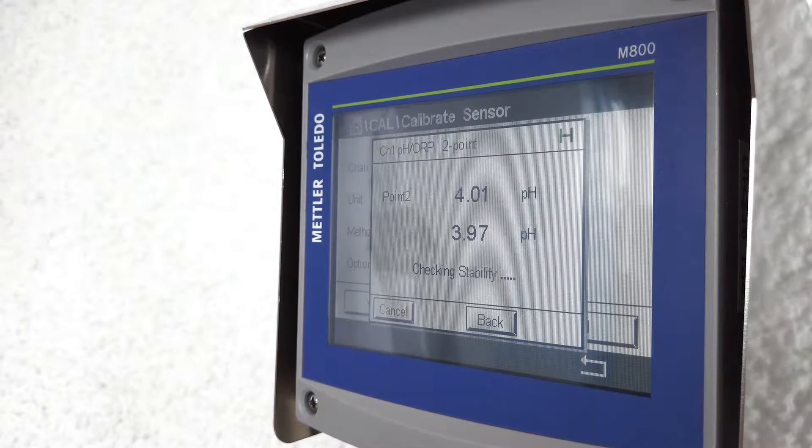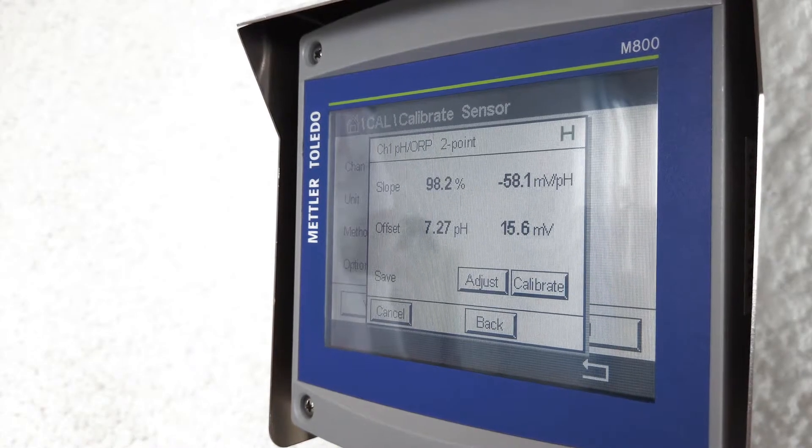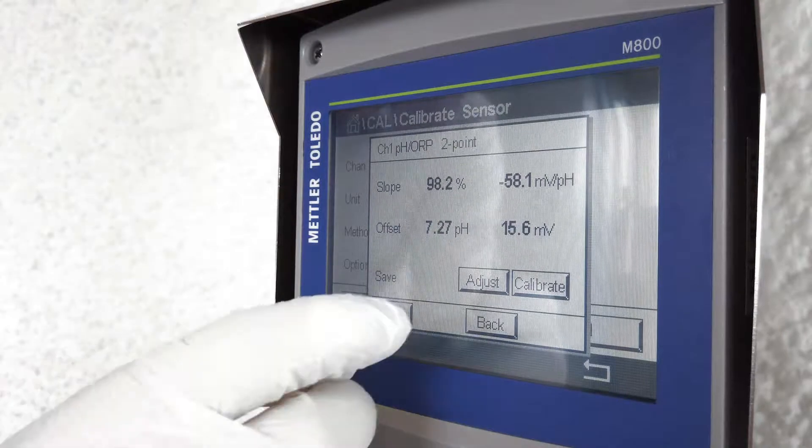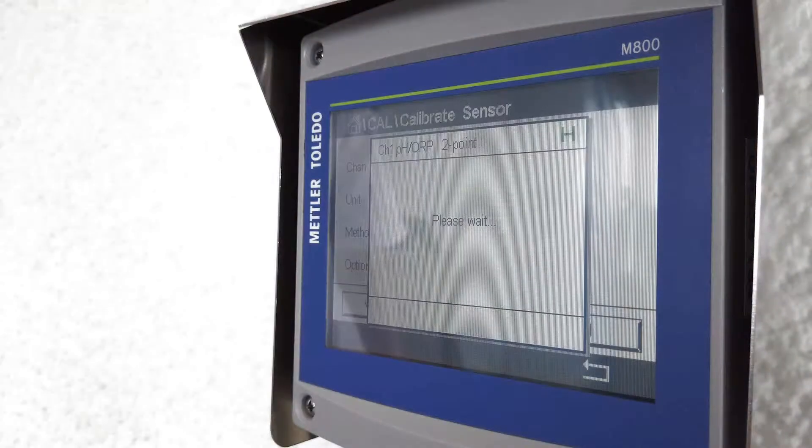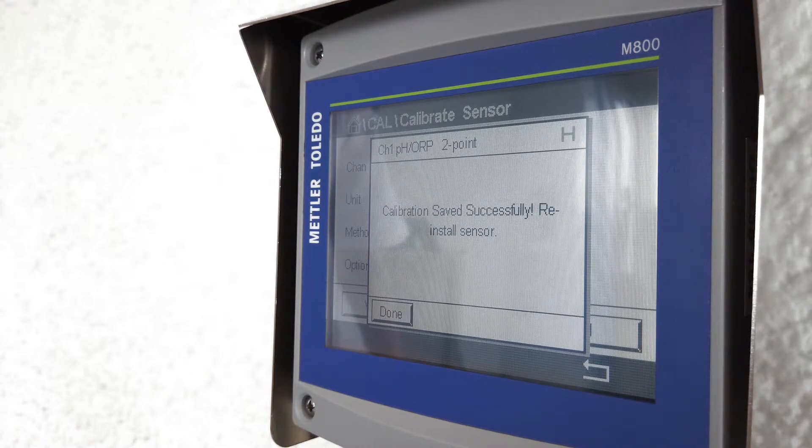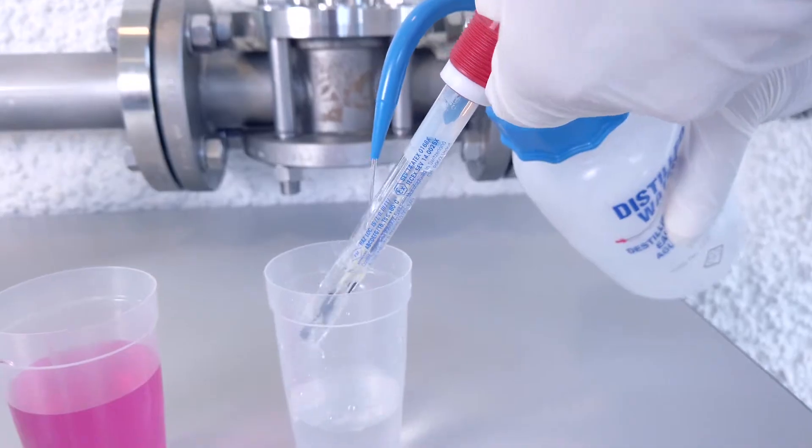Now you can see on the M800 transmitter that the sensor was calibrated with the displayed slope and percentage value and a zero point in pH value. You can now adjust the sensor by clicking adjust. This saves the calibration data and stores the values for the zero point and slope on the transmitter. Now your sensor is calibrated successfully.